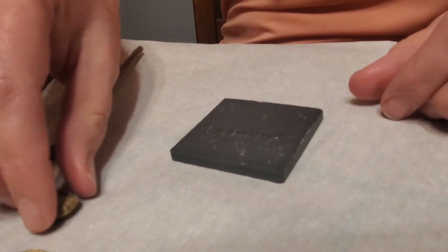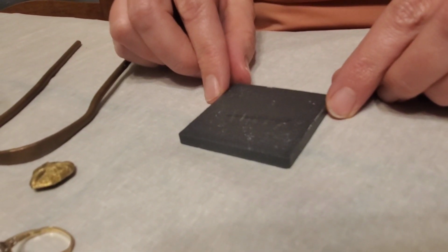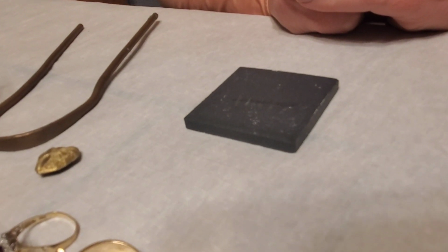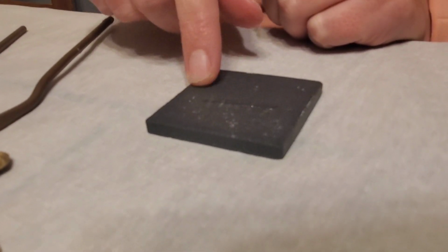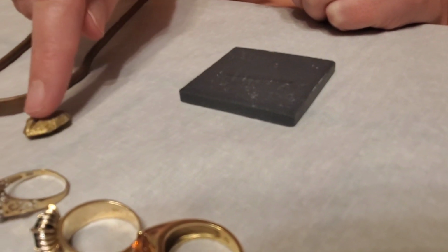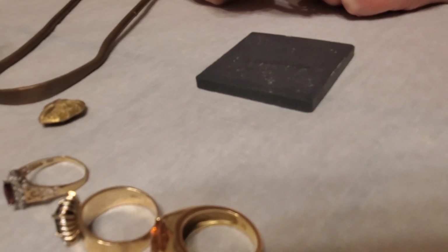Okay. So you give it just a minute. See what happens. Looks like they're all just sitting there. Looks like the copper's starting to disappear. Looks like the ring, this one's starting to disappear, and so is this. Looks like these two are holding on pretty good still.